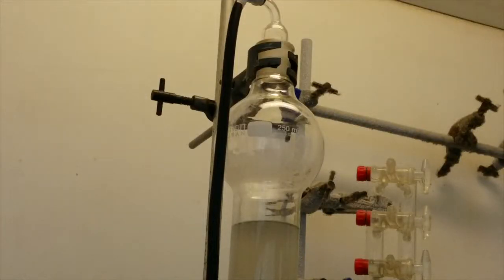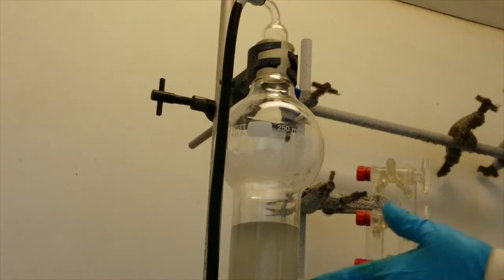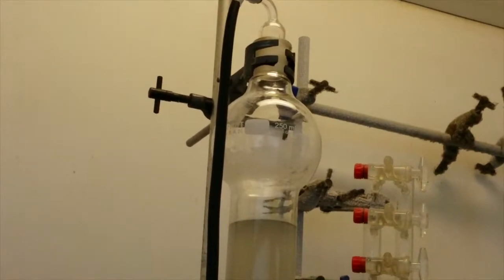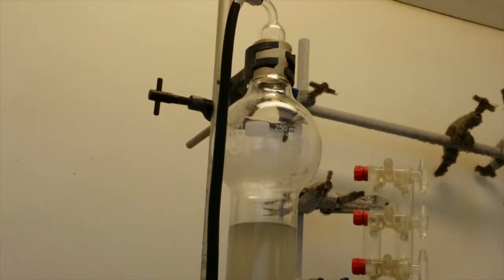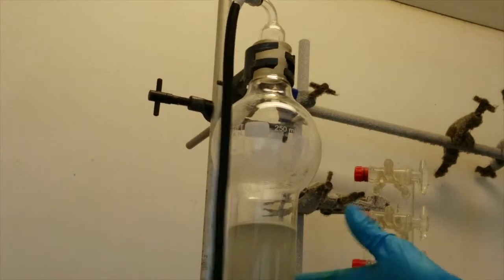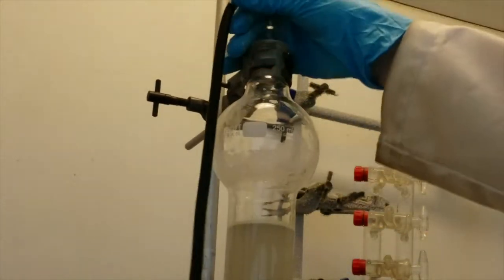Eventually the solvent level will drop to the same height as the silica in the column. At this point you will see no excess solvent above the silica but the silica will still remain translucent. At this point give the side of the column a good tap. This forces the silica at the top to form a totally flat layer and helps remove any air bubbles trapped in the column.